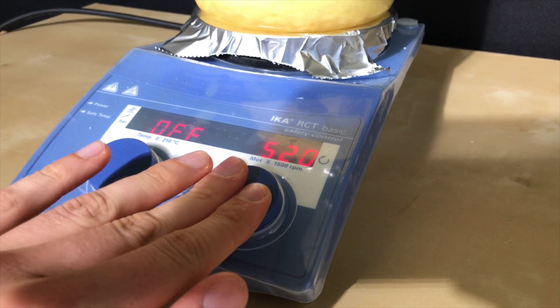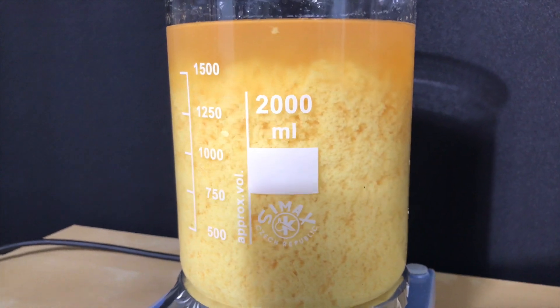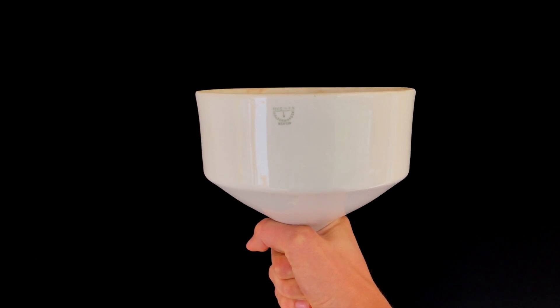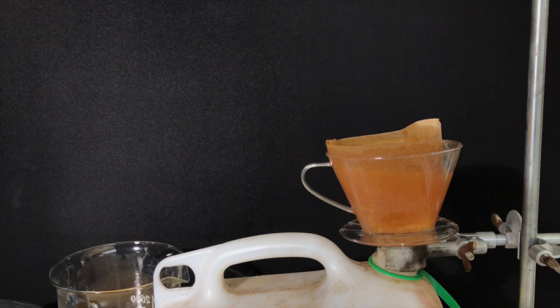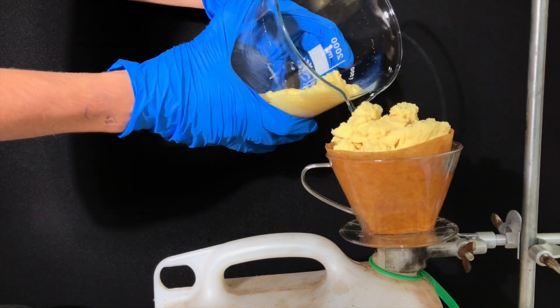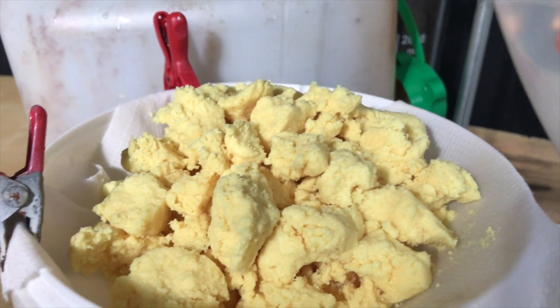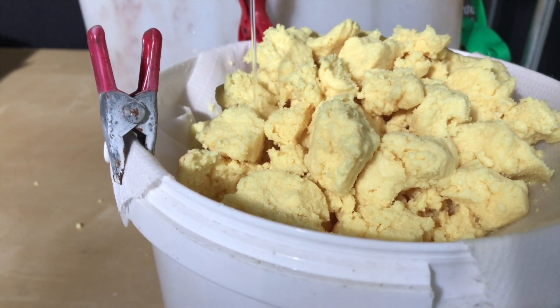Dibenzyl acetone is poorly soluble in a mixture of water and ethanol and therefore crashes out after being produced. I initially wanted to do a vacuum filtration using a large funnel, but unfortunately I didn't have any filter papers for it, so we had to do a gravity filtration instead. Not all of the product fit in the filter paper, so I even ended up using a piece of cloth to filter the rest. The product was rinsed using a lot of distilled water to remove leftover sodium hydroxide, but the product should already be decently pure.